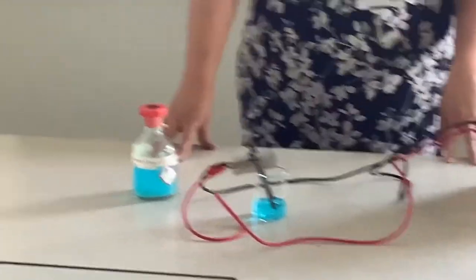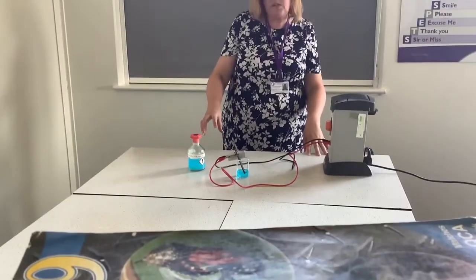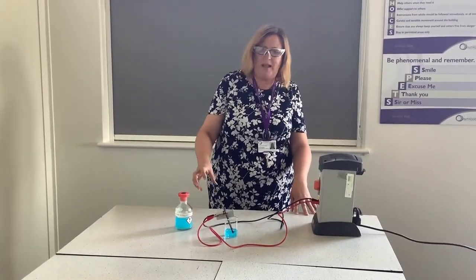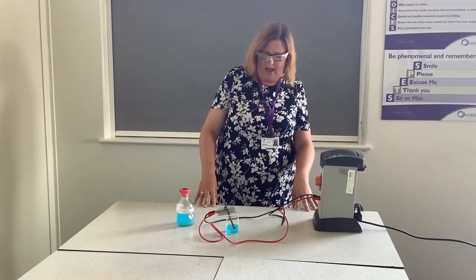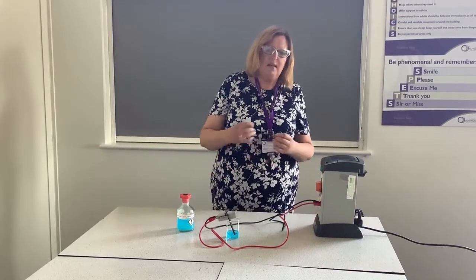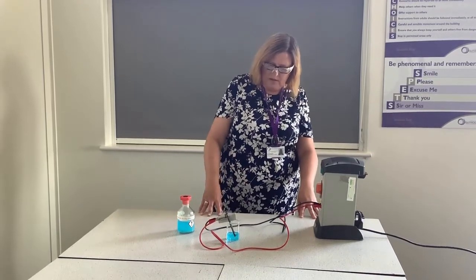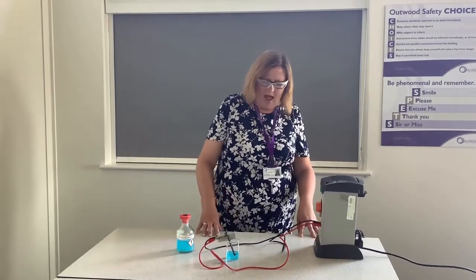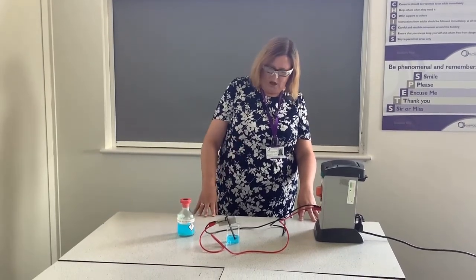Copper chloride is an ionic compound. It contains metal ions — that's the copper — and they will be positively charged, because all metal atoms lose electrons to form positively charged ions. We've also got chloride ions, which are negatively charged. Non-metal ions always have that negative charge because they gain electrons to form the ions. In solution the lattice that normally holds ionic compounds together has been broken, so they're free to move around, and opposites attract. We have a positive electrode and a negative electrode and they will attract the oppositely charged ions.